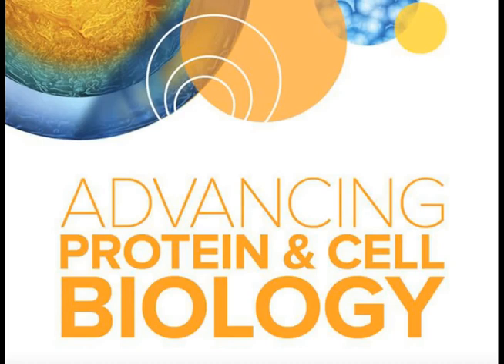Yeah. There's also MetaXpress PowerCore, which can speed up the analysis time by distributing the analysis around to different computers. And you're looking at maybe reducing the 3-hour quick module down to 45 minutes, and taking that 30-hour one down to maybe 5 hours. Yeah, you can sometimes get maybe a 10x improvement, so maybe 3 or 4 hours.